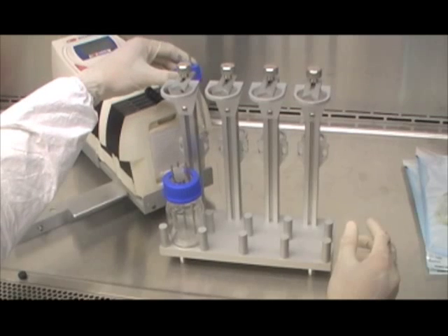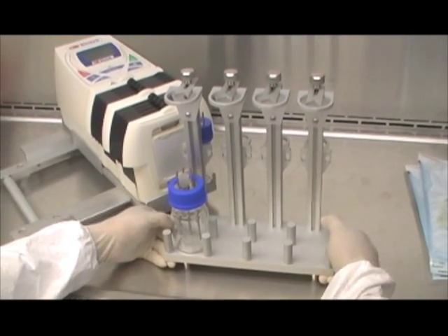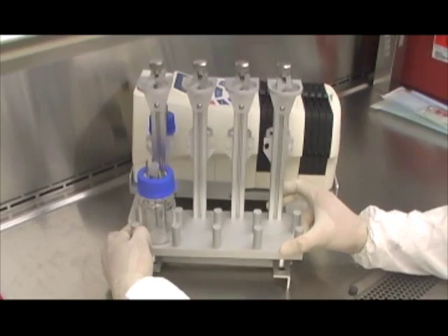As a first step, place the autoclaved media reservoir and CO2 humidifier bottles on the aluminum stand. For the purpose of this video, we will use one set of bottles. Then place the aluminum stand and secure it on the aluminum base frame.